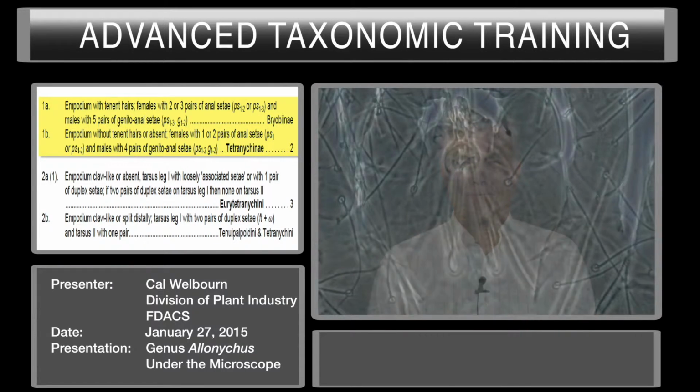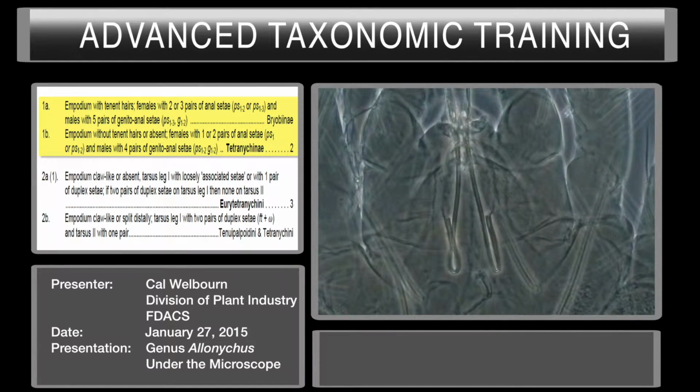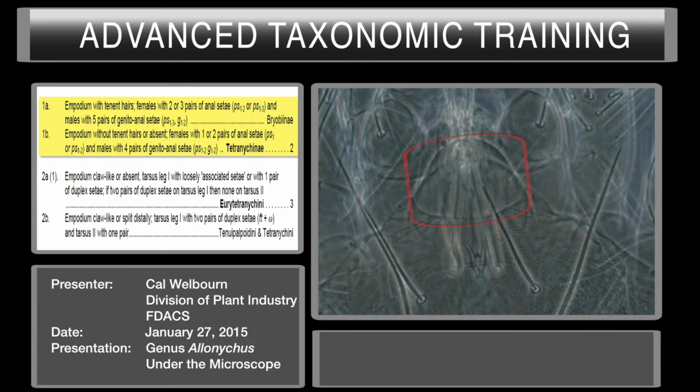Okay, now we're going to key out the genus Allonychus. At this point, we will assume you already know it's a Tetranychidae, and I'll briefly review the characters of Tetranychidae. One of the key characters of Tetranychidae is the movable digit. The movable digit of the chelicera is long and has a proximal hook. In addition, the chelicerae bases are fused into a retractile stylophore.